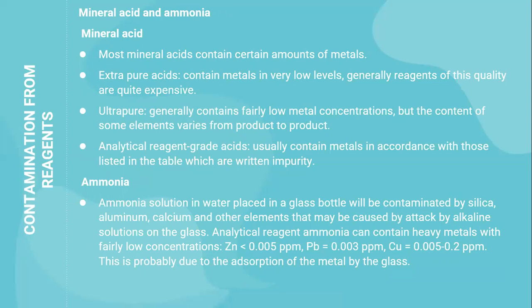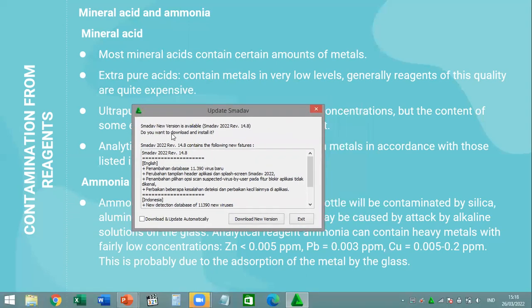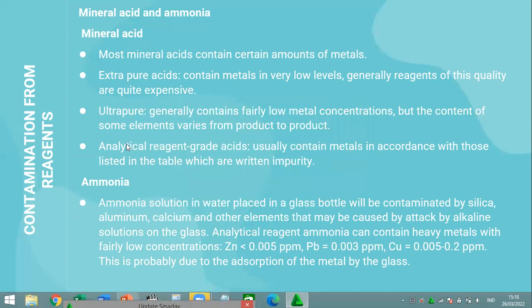And then ultra pure generally contains very low metal concentration, but the content of some elements varies from product to product.